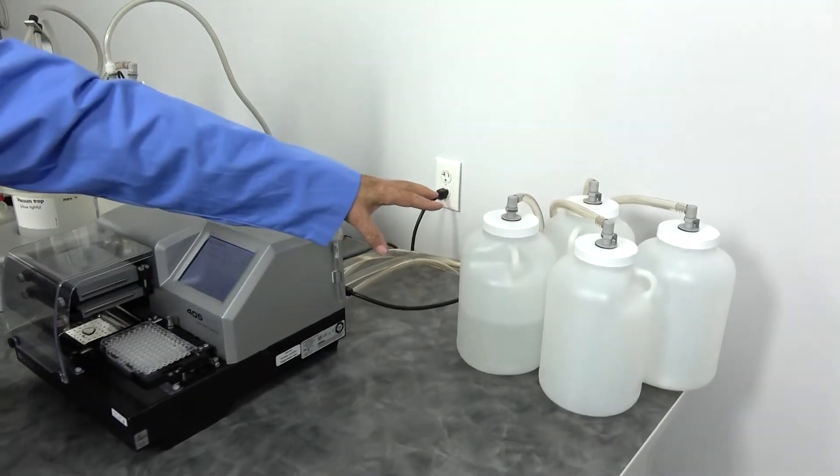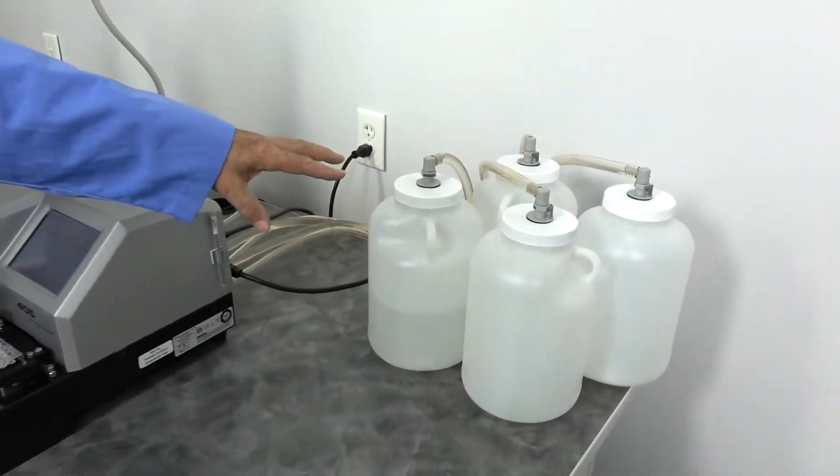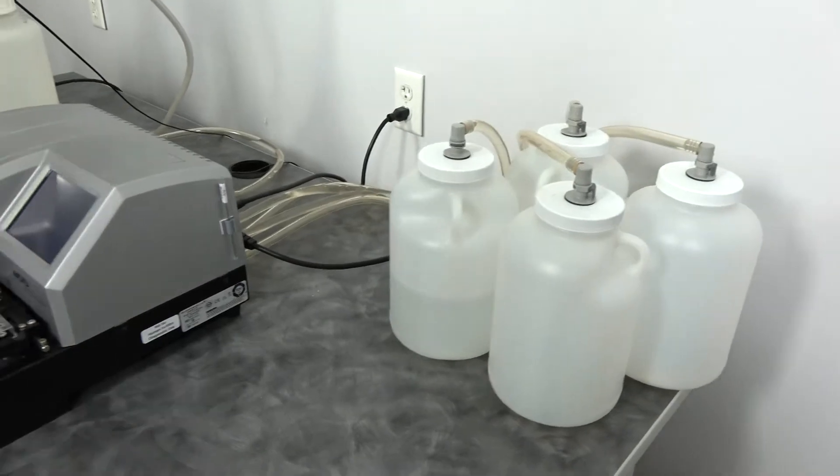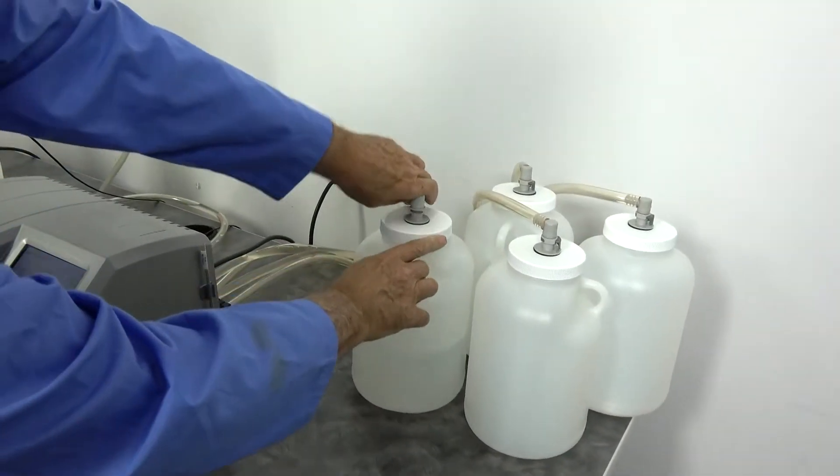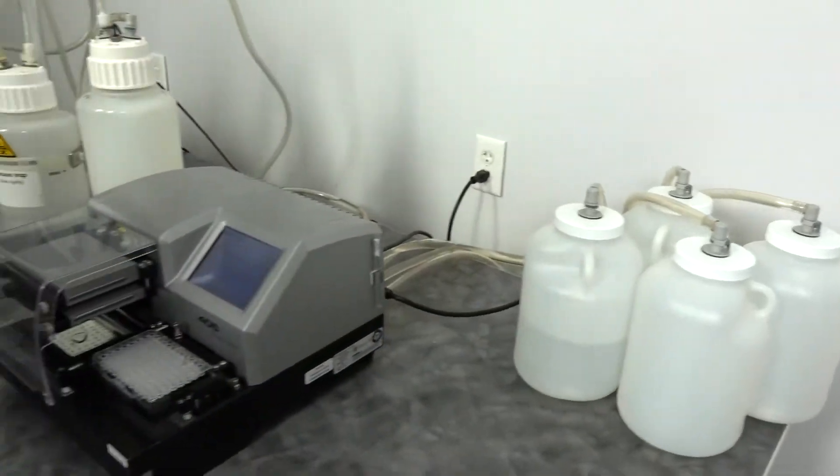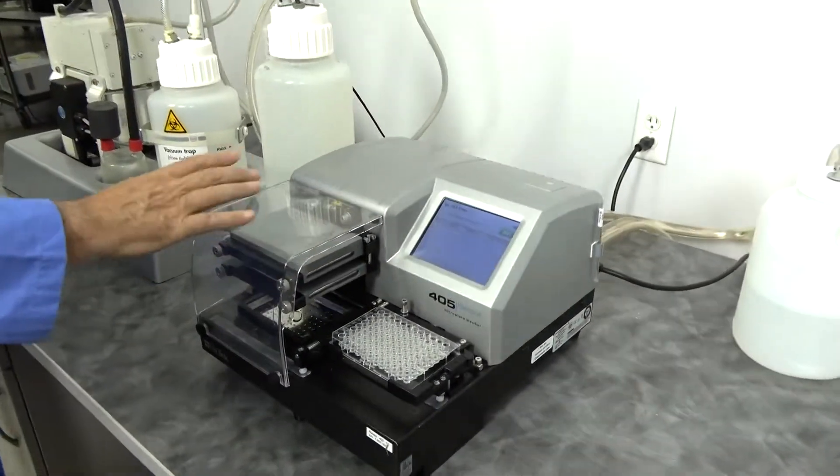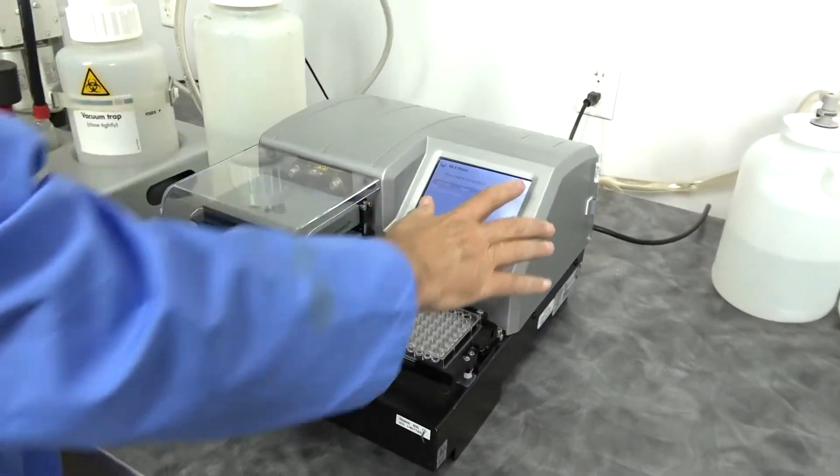Four waste or reagent containers with quick-release knobs. The system is fast, it's quiet.